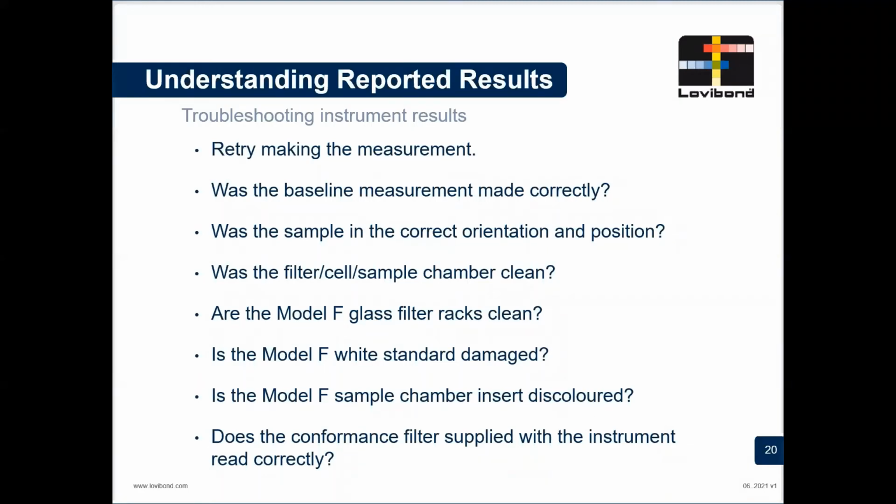Can I eliminate the instrument out of this, or is it something to do with my sample? So we just need to go through and find out where the problem actually is.